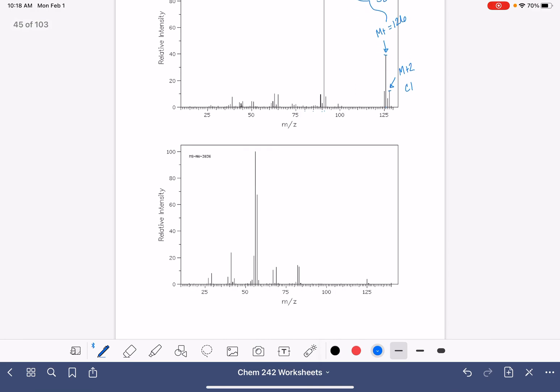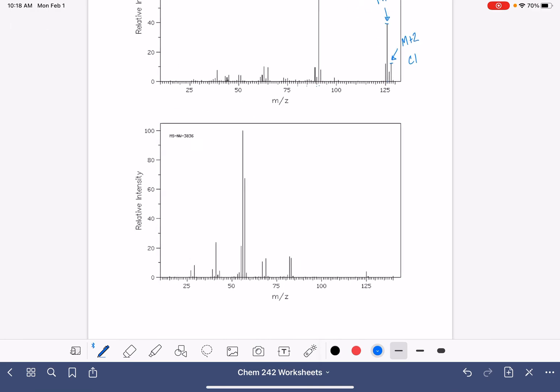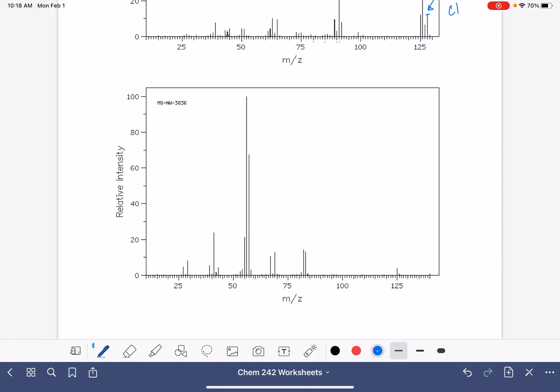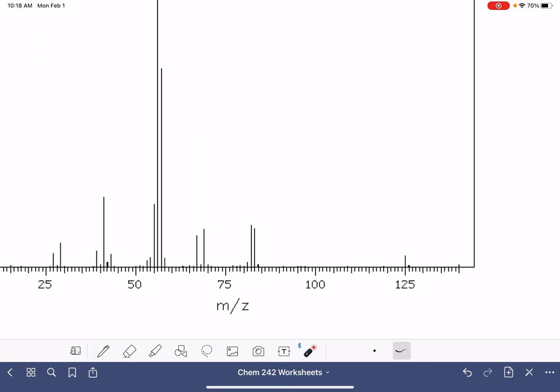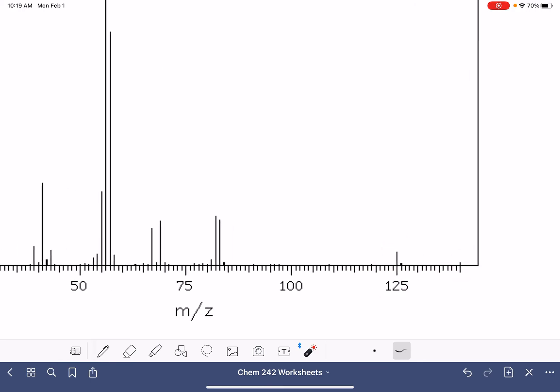We have one more to go. So again, keep in mind that the mass spec, the axes adjust itself. So don't be distracted by this. Keep looking at this little tiny guy out here.